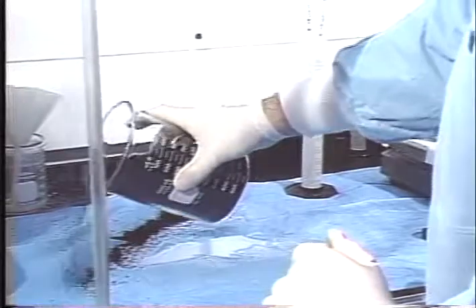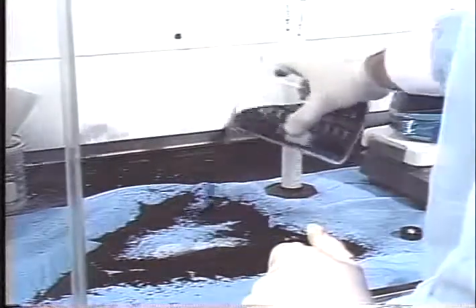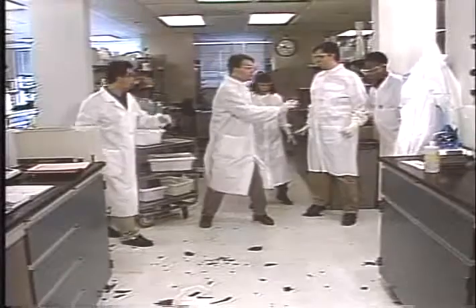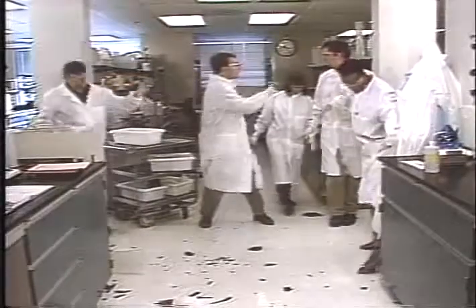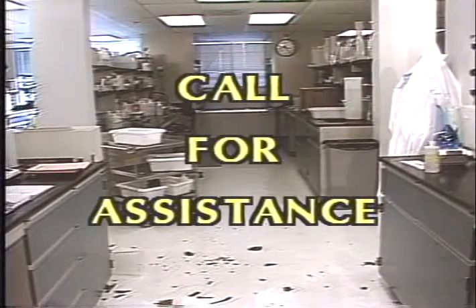In the event of a small spill, soak up the formaldehyde with an absorbent material. Place the waste into a properly labeled and sealed container for later disposal. Do not attempt to handle large spills of formaldehyde. They should only be dealt with by properly protected and trained personnel. This substance is toxic and can overwhelm you. Alert other workers in the area. Vacate the laboratory immediately and call for assistance.